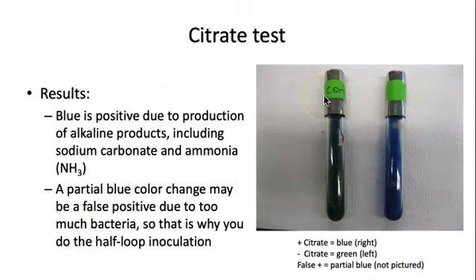Okay, so that's the end of our metabolic tests. Again, I would just point you to the to-do list at the beginning of this presentation. Make sure you can recognize what a positive test looks like based on these pictures that I've shown you, and then also fill in those charts and really use those as a study guide, because that will summarize the names of the tests and the enzymes, the reagents, and what the positive test looked like.